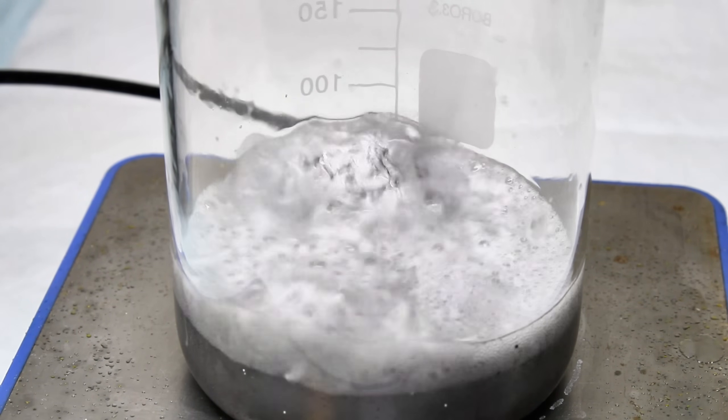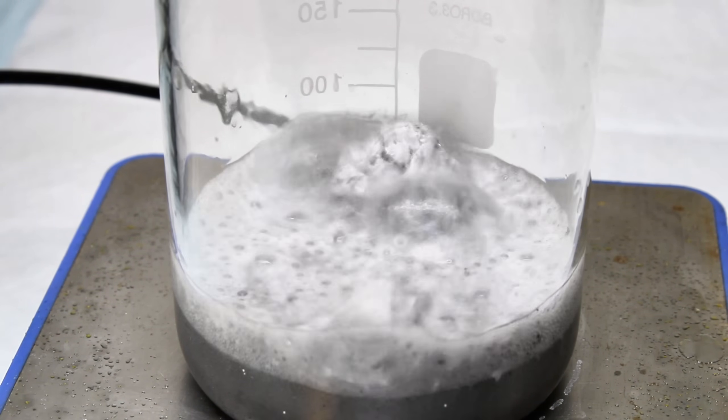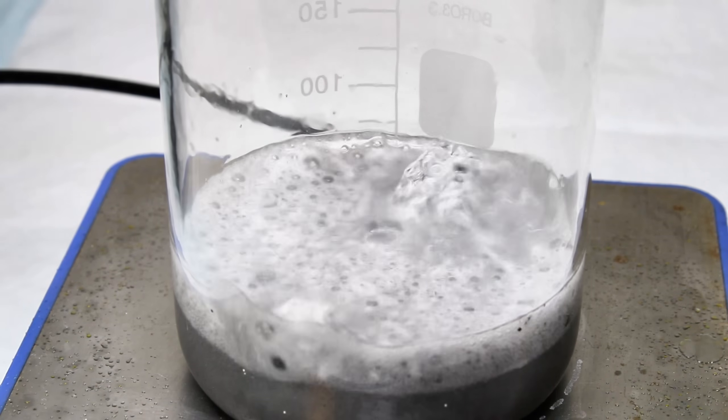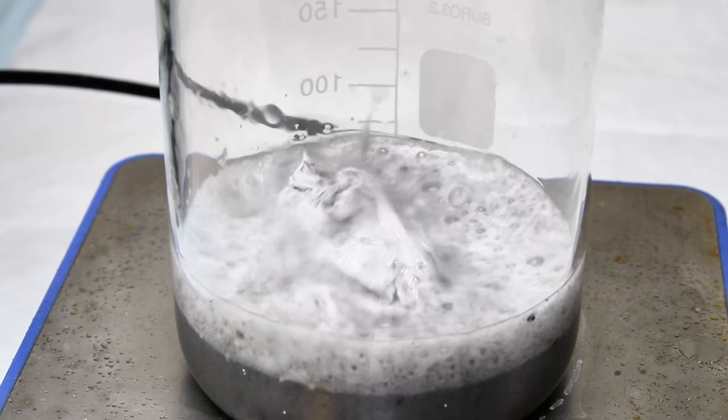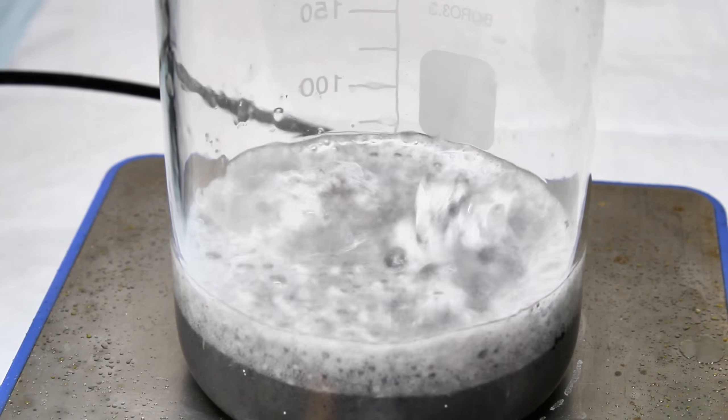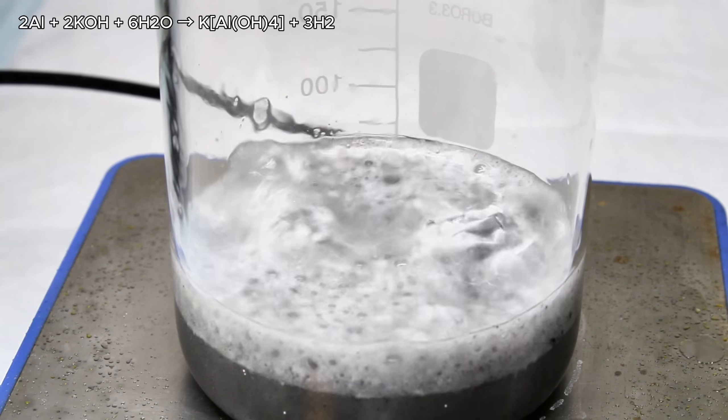As you've been watching here, when aluminum foil is added to the caustic solution, it's quickly dissolved in a violently exothermic reaction that produces copious volumes of explosive hydrogen gas and choking caustic fumes.